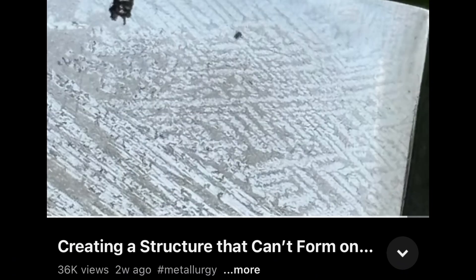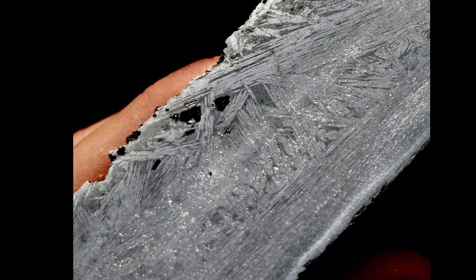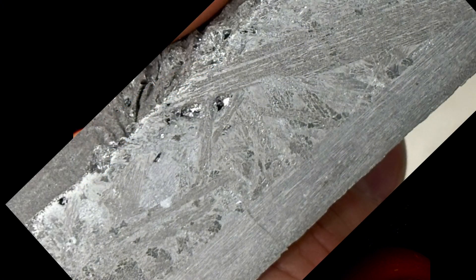So in this video we'll be exploring etching. I actually did etch it — this ingot here is one of the first iterations of the alloy, and I etched this exact ingot. After etching, it looks a little something like this. Personally, I think this is really ugly and it actually looked better before. But let's take a closer side-by-side comparison and understand why it looks kind of bad. Here are the two ingots, etched and un-etched. In my opinion, the un-etched sample looks far better because there's far more contrast and you can resolve the intermetallic rods easier.